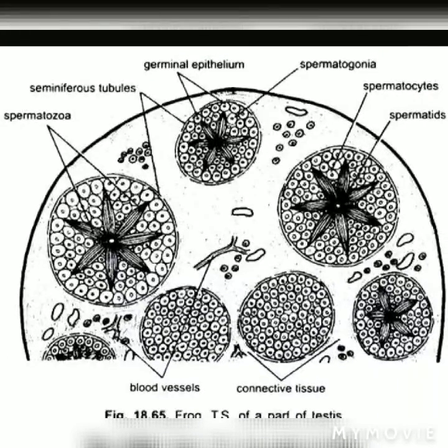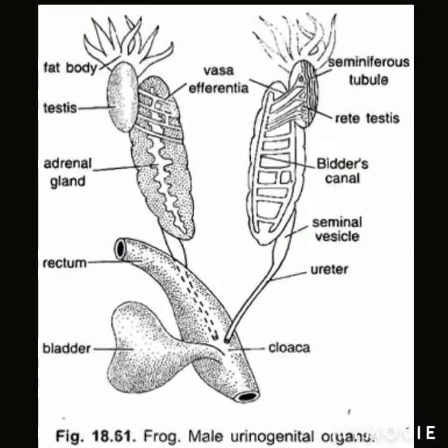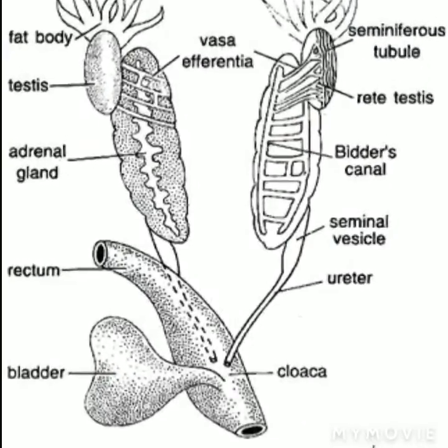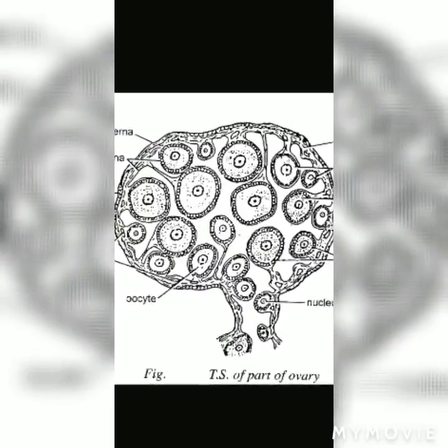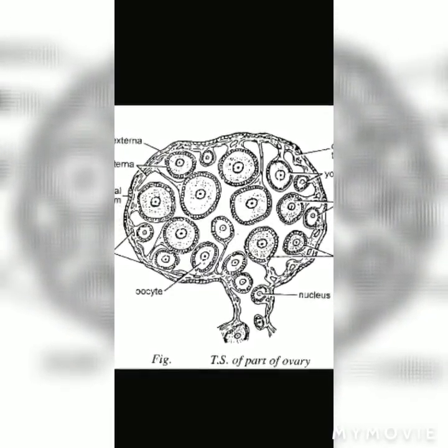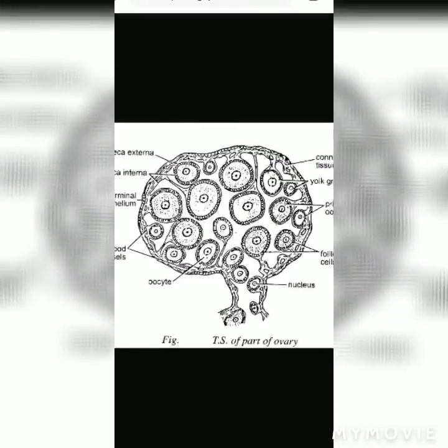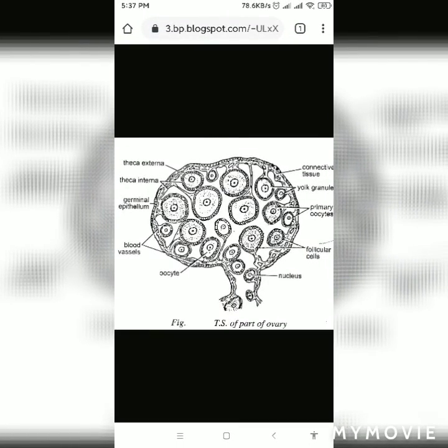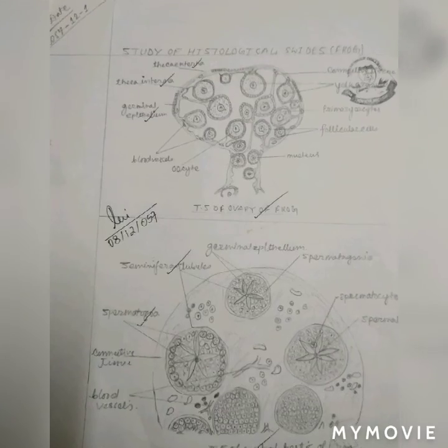Comments on TS of testis of frog. The outer covering is the peritoneal epithelium or peritoneum. Numerous seminiferous tubules are held together by the intertubular connecting tissue. Bundles of spermatozoa are seen in the lumen of the mature seminiferous tubules.